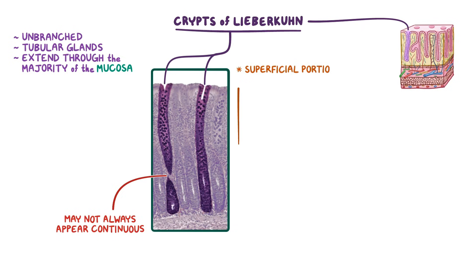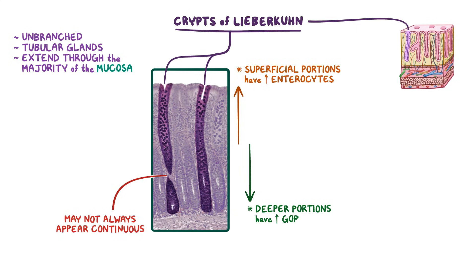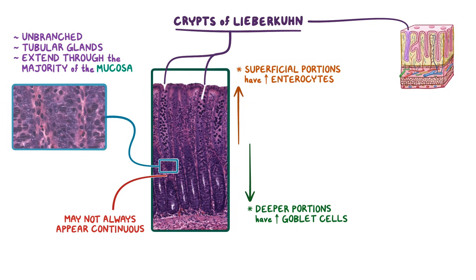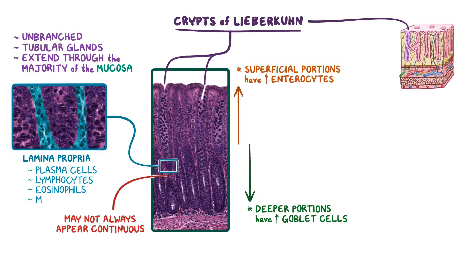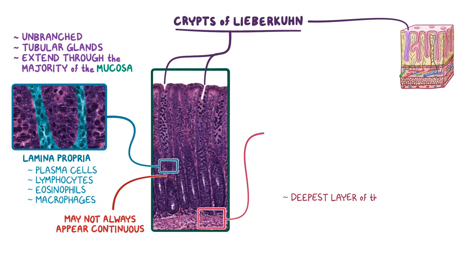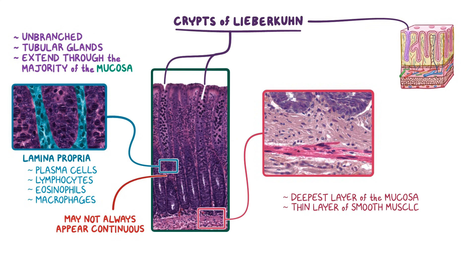The superficial portions of the crypts will typically have a higher concentration of enterocytes, and the deeper portions will have a high concentration of goblet cells. The tissue found between the crypts and the epithelium is the lamina propria, which consists of many types of immune cells including plasma cells, lymphocytes, eosinophils, and macrophages. The deepest layer of the mucosa is a thin layer of smooth muscle called the muscularis mucosa.